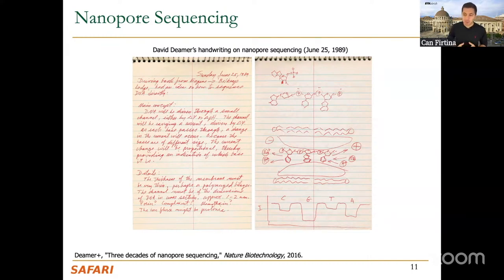Can we build a system, a structure, such that we can let the DNA move from one direction to another direction? And to do this, one of the good ways is to create a voltage difference where you have one layer that is negatively charged and the other layer is positively charged, and then you let the physics work so that a negatively charged DNA is drawn towards the positively charged side, right?